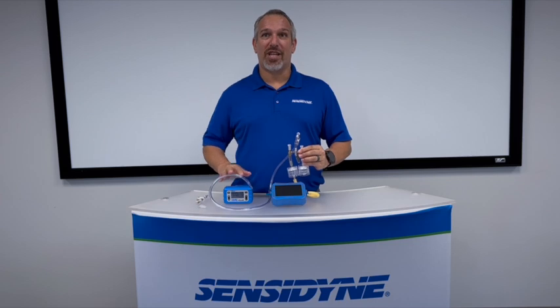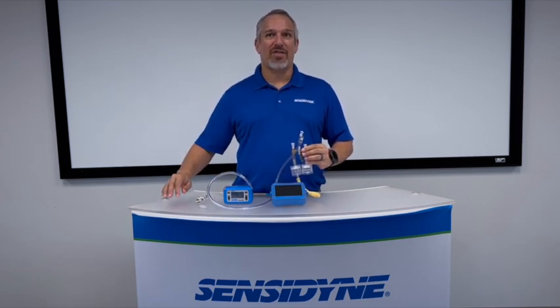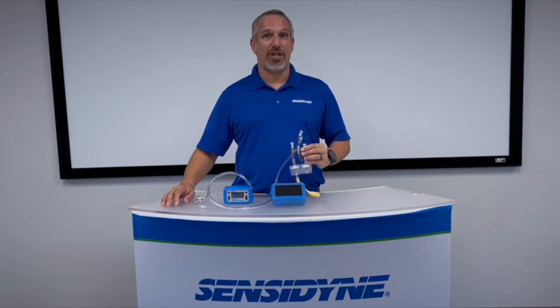Welcome. Today we're going to go over calibrating a high-flow splitter manifold using a Gil-Air Plus pump and our Go-Cal Pro calibrator. This serves applications such as welding operations where a metals panel and hexavalent chromium may both be required to be sampled simultaneously.